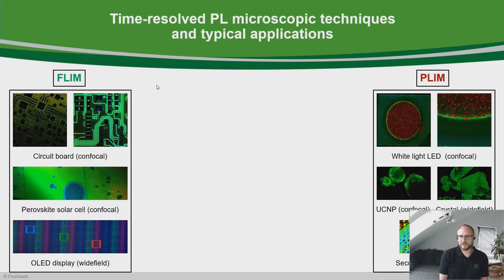On the other hand, there's also the possibility to use upconversion materials, which are promising, because here you excite in the NIR and you get a signal in the UV-Vis. So it's really interesting, for instance, for 3D printing. So deeper penetration depth and still a lot of efficiency and no problems with other light.